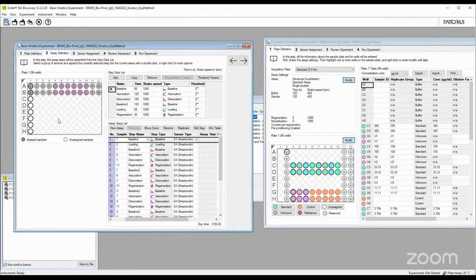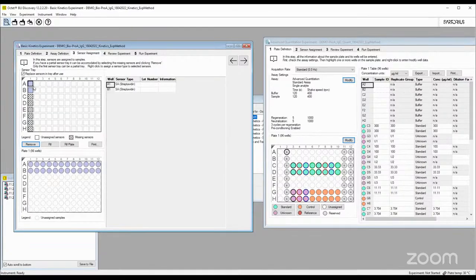So see this sample one. So one is here, then two, then three, like that, with the step where it is going. Also, we need to show the sensor assignment, on which of the positions the sensors are there. So we'll have to make sure that it is on a single line because it cannot take randomly from here. Throughout the line, we can go up to 8, or we can obviously go 1 or 2.